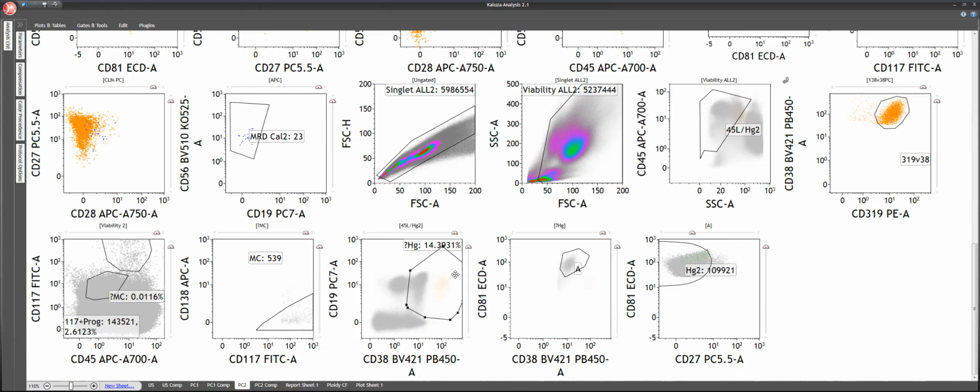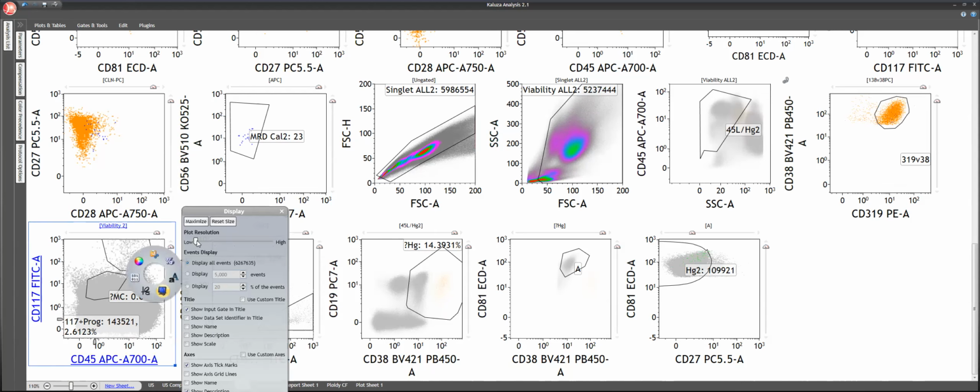Then we can also look at hematogones here, because these are the plasma cells, but we have CD38 bright and CD19 positive cells that are basically hematogones, in which with the help of CD81 and CD38 we can confirm these are hematogones. So for CD117 we have CD117 precursors also, so we can adjust the gate with CD117 here.